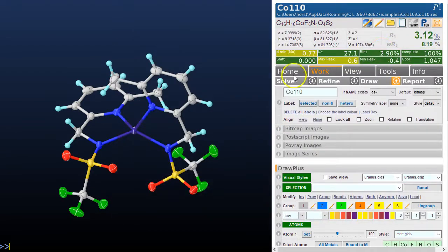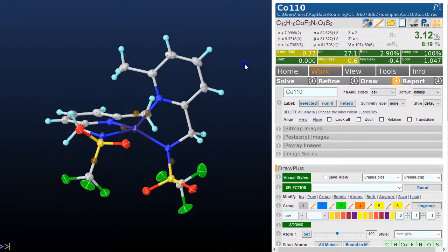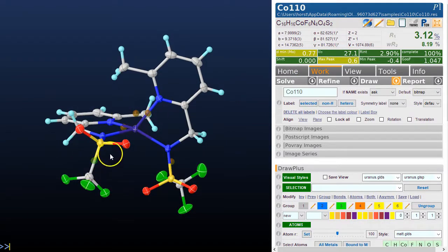If you want to know about the Q peaks — where's the biggest peak — switch the Q peaks on with Ctrl+Q. I'm doing this on the keyboard, and then click on this field and the biggest peak will be selected, and it's this one here.